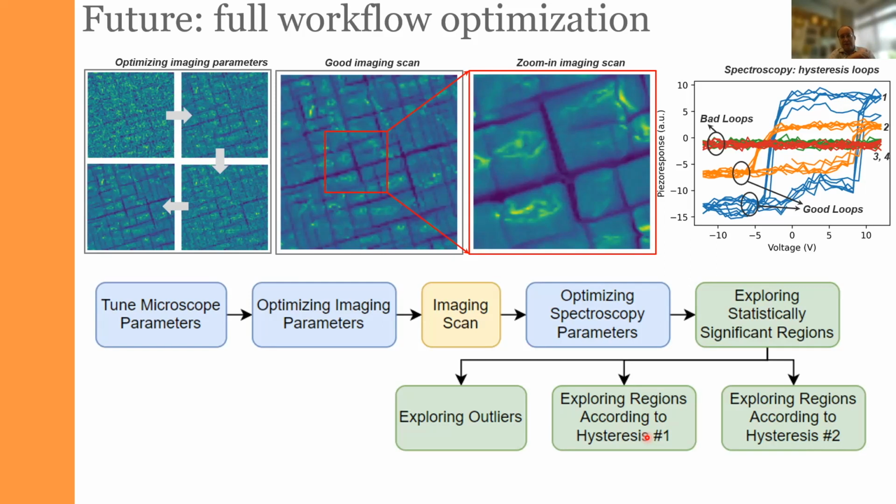What I think is that realistically, at least for the next several years, it will be human-in-the-loop interventions that will define the experiment. We can optimize this workflow from the end target, and then we have to use RL and go through it many, many times, classical TD lambda learning. Or we can monitor the progression of the experiment and use the human-in-the-loop approach to switch between the different optimization targets. That seems to be closer to the way that humans work now. We'll see whether it is the case or not.